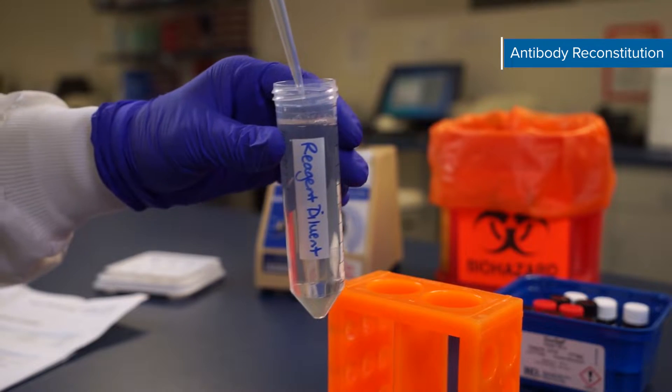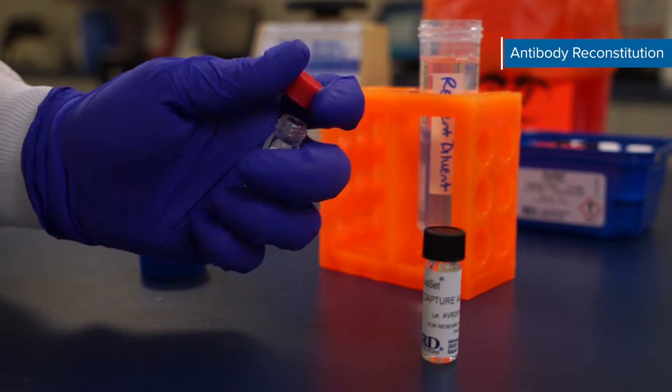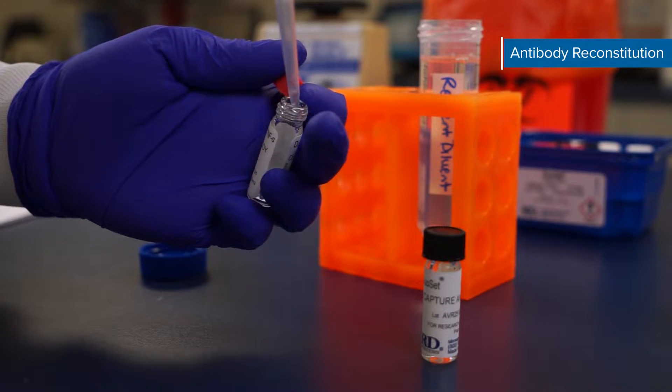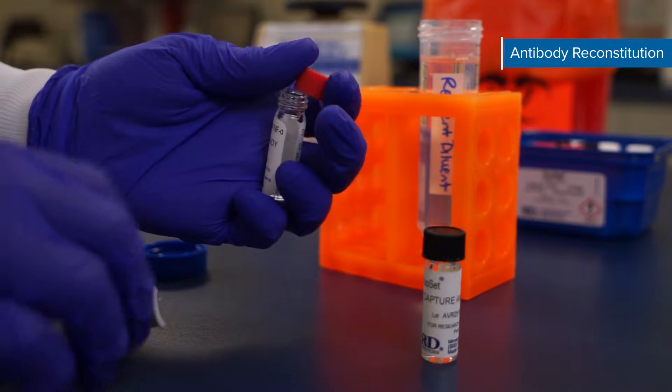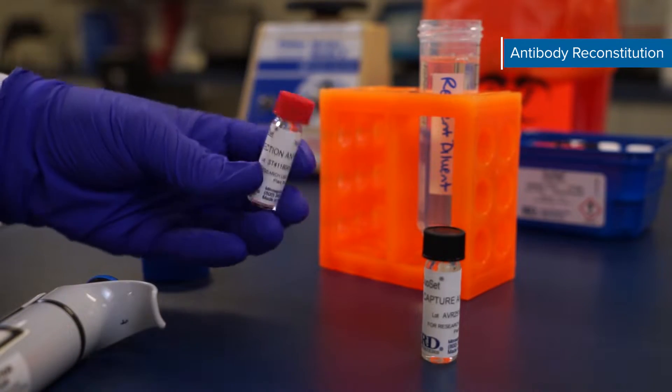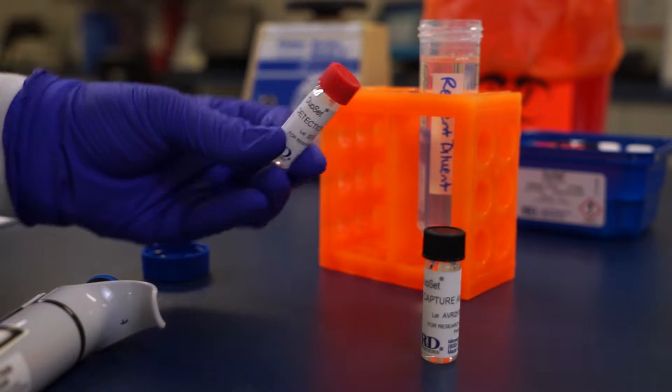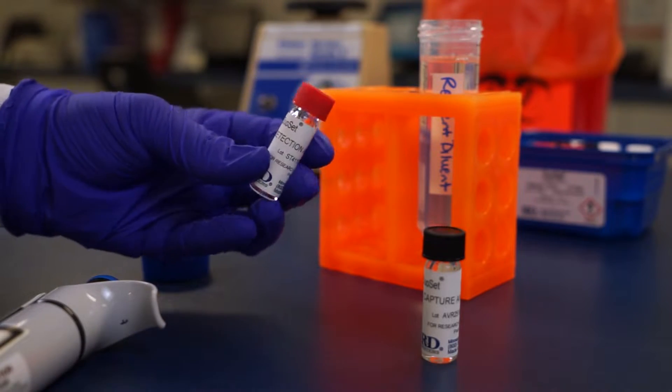First reconstitute both lyophilized antibodies. Avoid vigorous mixing of the vials. Allow the capture antibody to sit for a minimum of 15 minutes before coating your plates or preparing single-use aliquots for storage. Store the detection antibody overnight at 4 degrees Celsius before aliquoting. Refer to the certificate of analysis for storage temperatures.